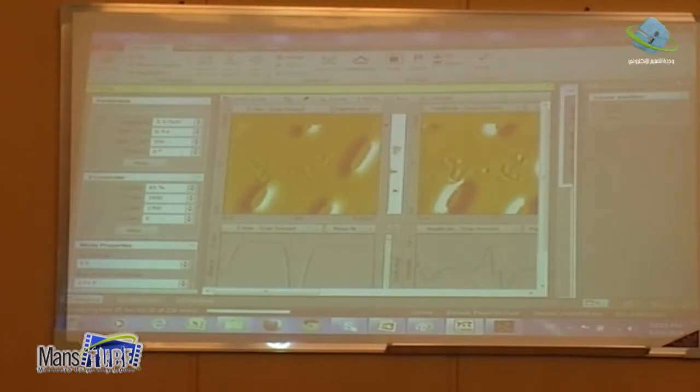Sorry. Okay, the thickness of the line, how much? I mean, I have to see. I think it should be like thickness, I mean the width, the distance from here to here. I just need to make like.